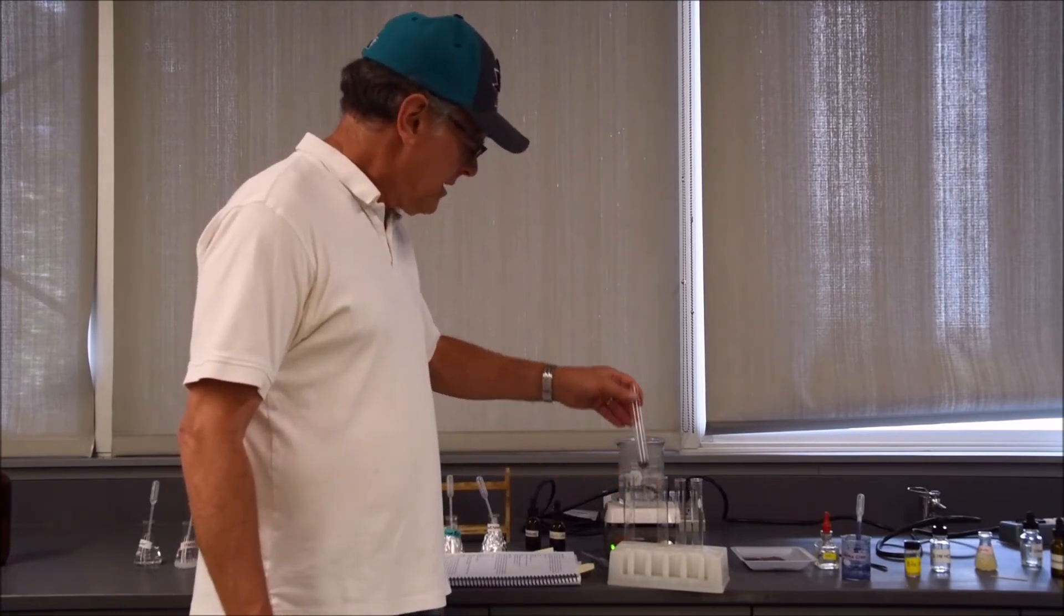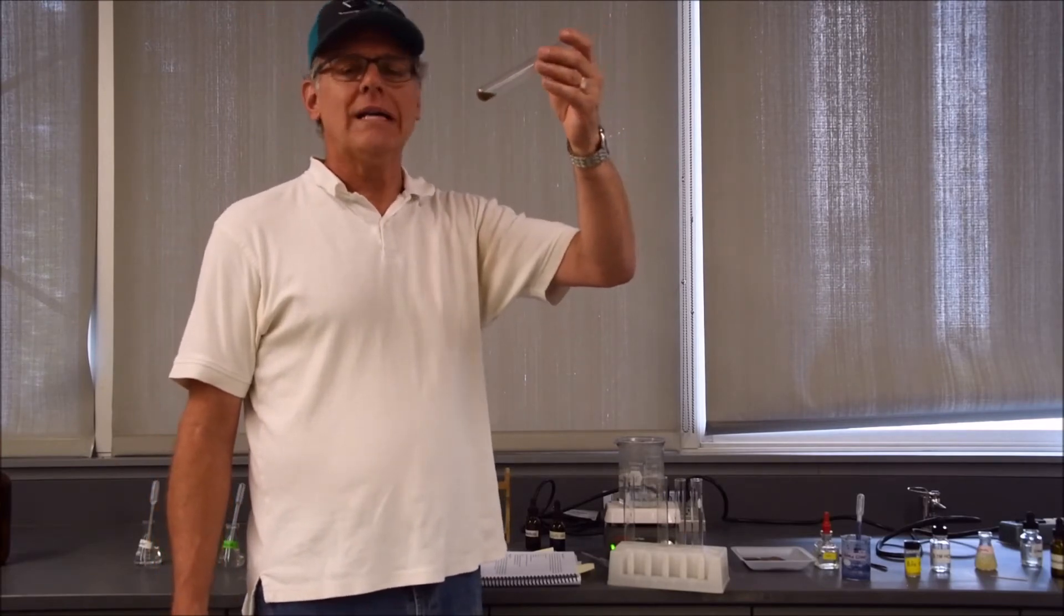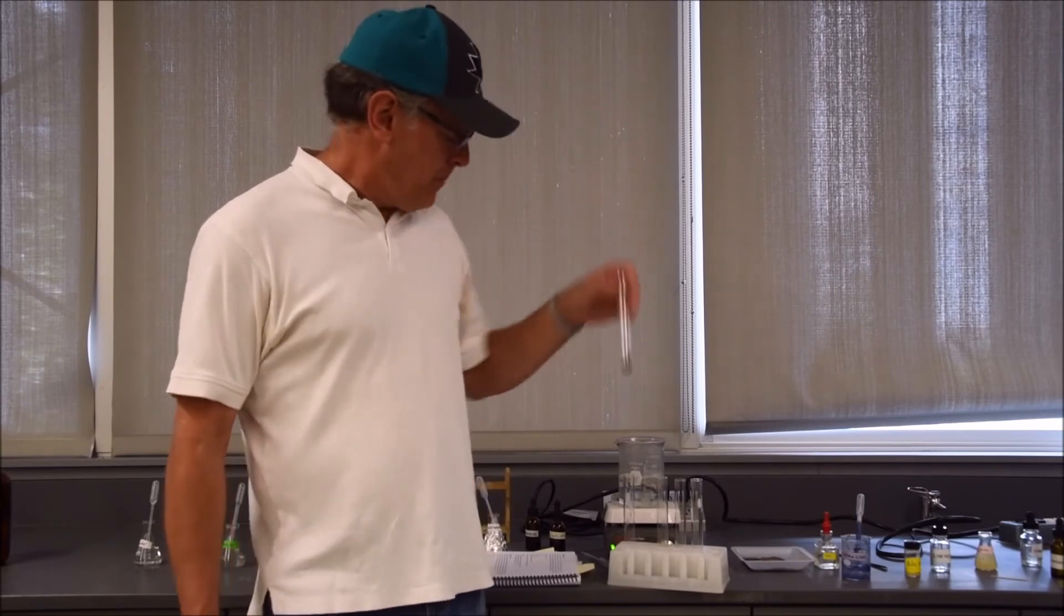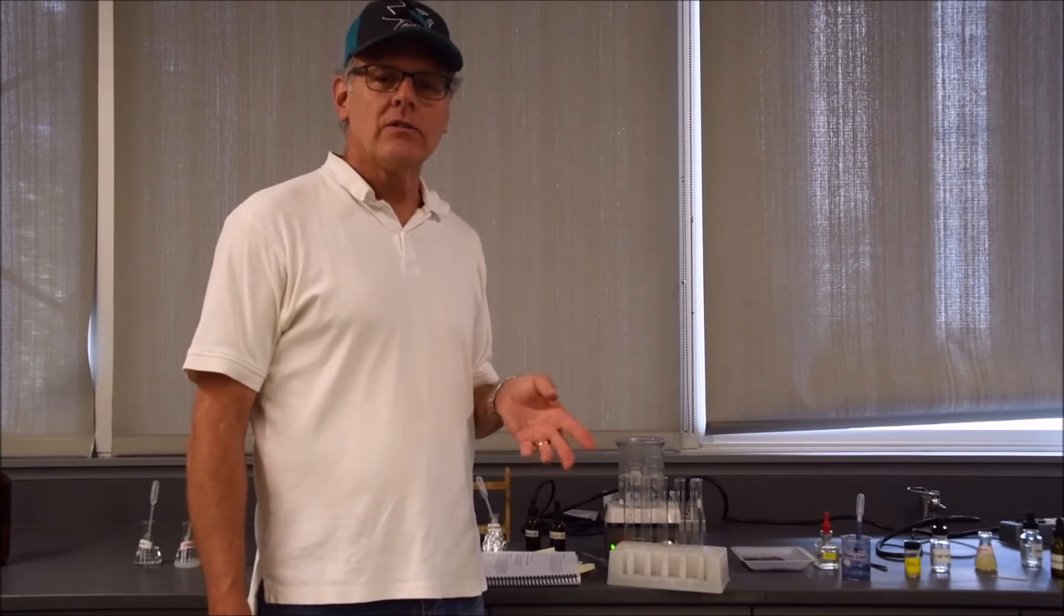Tube number two had starch in it, and this one changed just a little tiny bit to a greenish color. The Benedict's reagent is quantitative as well as qualitative. It tells us yes, there are monosaccharides present, but also how much. The darker the color, the more that are present.